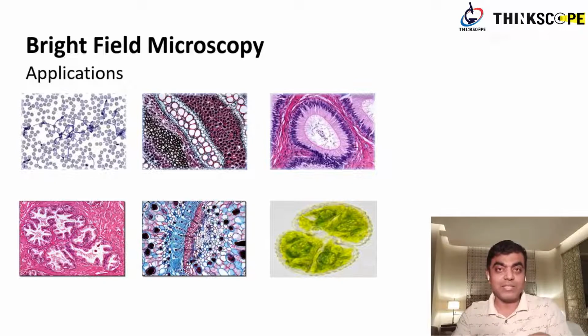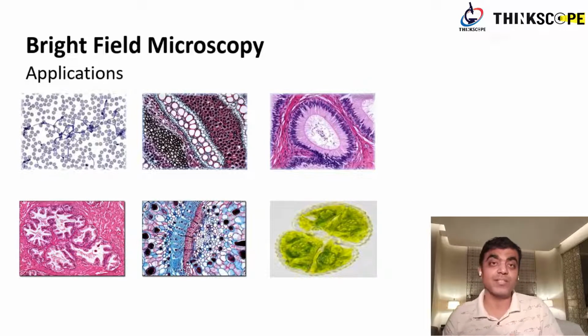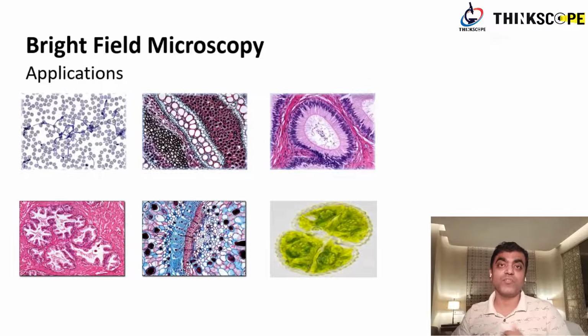Interaction means it is a fixed one, it's dead, it will not have any movement, that's true. But at the same time, if two cells are there and one cell is not healthy, you can see from the morphology that the neighboring cells will also be different. So you can count, for example, ER PR. If you have CD4, CD8 marker cells, the marker cells will be stained darker, the healthy cells will be stained lighter. You can count the percentage of your marker cells compared to the healthy cells.